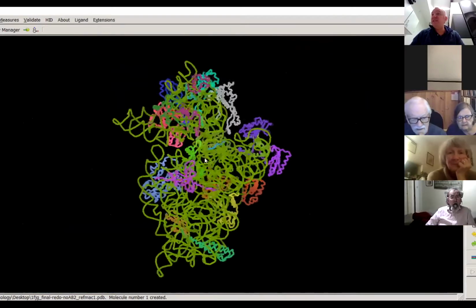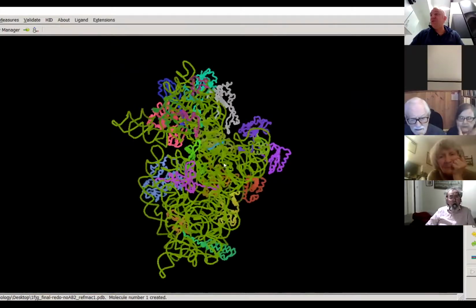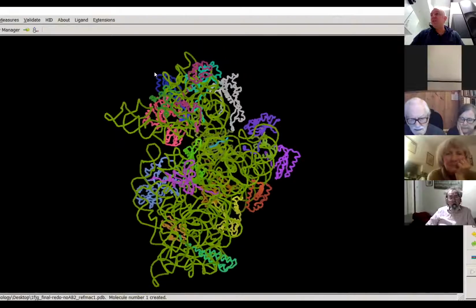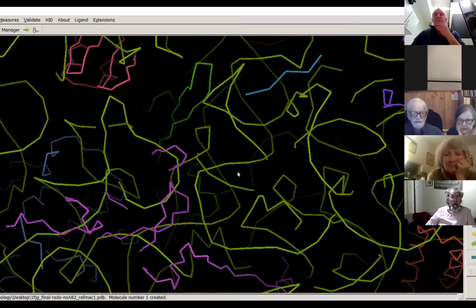Right, okay, so this is the small subunit of the ribosome. In green, you see the RNA. In different colors, you see the proteins. And this was a project that took 5 of us in the lab working on. I only contributed to this, but we were able to solve this structure during my PhD. My role in this was to soak the ribosome with antibiotics.